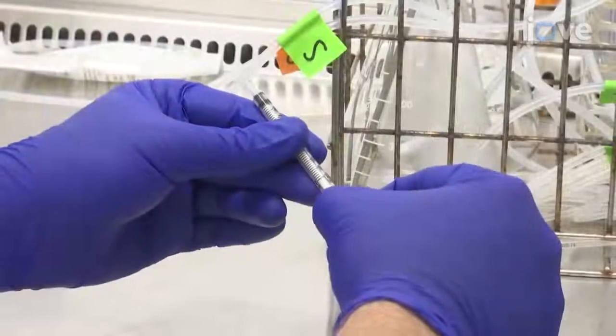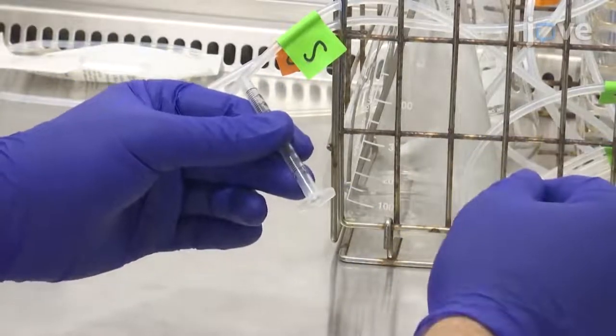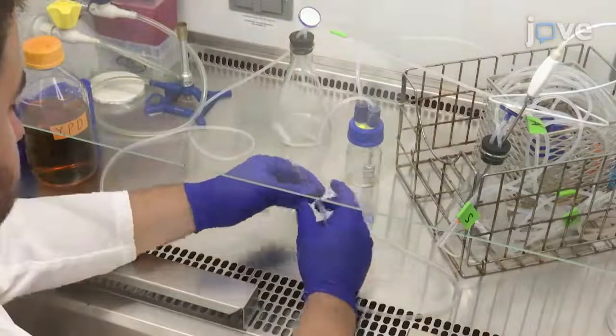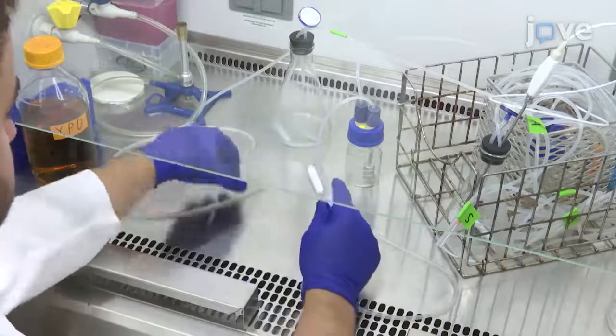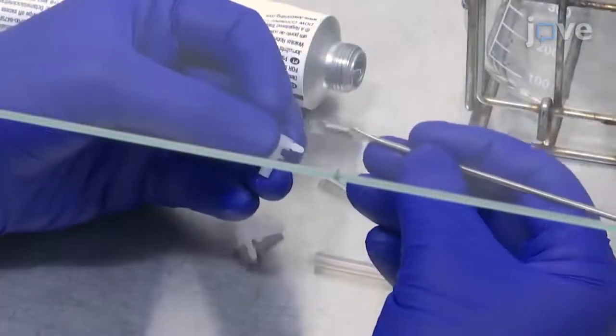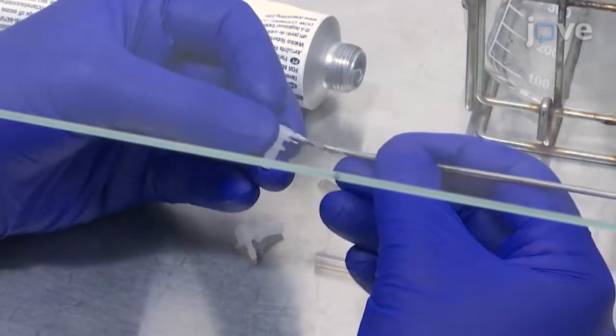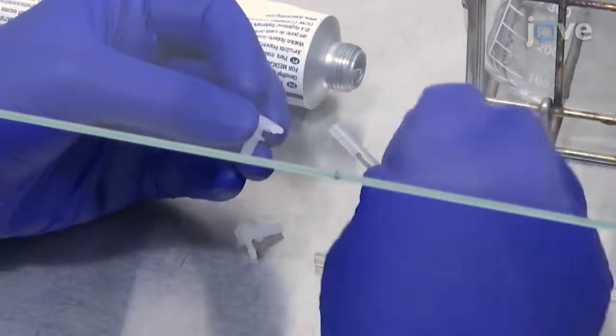To assemble the filter, remove the plunger from a 1 milliliter syringe to make it an adapter. Force the tubing from the filter bottle into this end, and attach a 0.2 micron filter to the tubing leading to the growth flask. Apply silicone vacuum grease around the barb of the slide adapter prior to connecting it, as this helps prevent air leaks into the system.